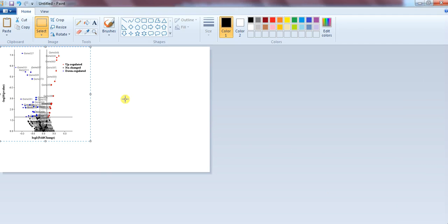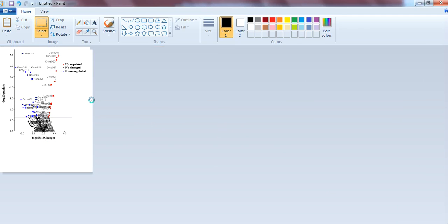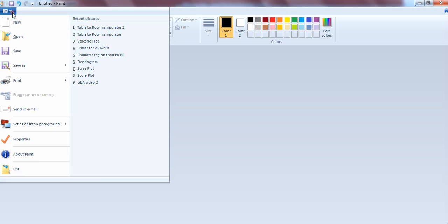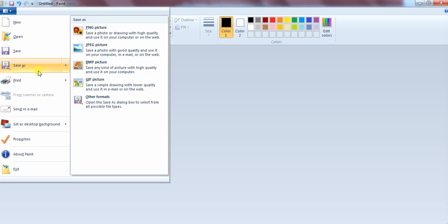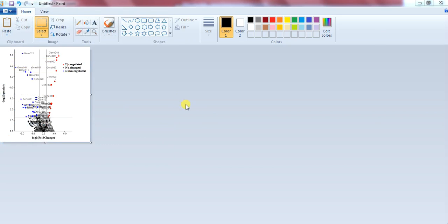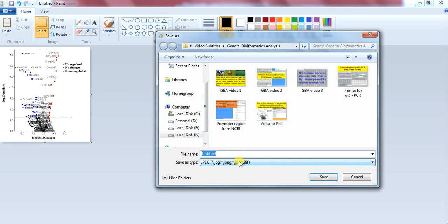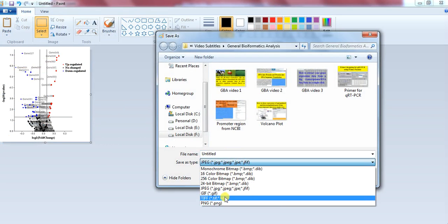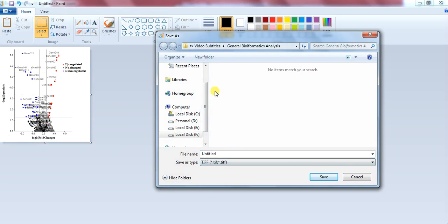Copy and open a new paint file. Paste and adjust it according to your choice and save it in your destination folder.